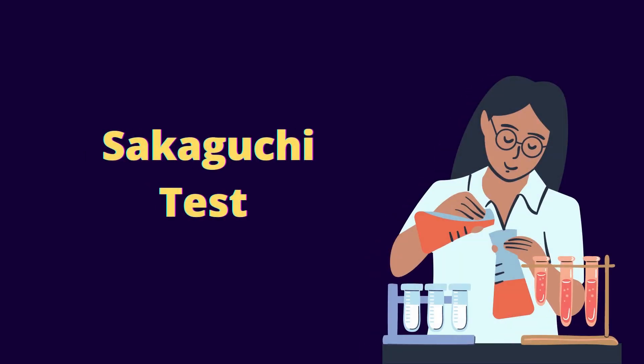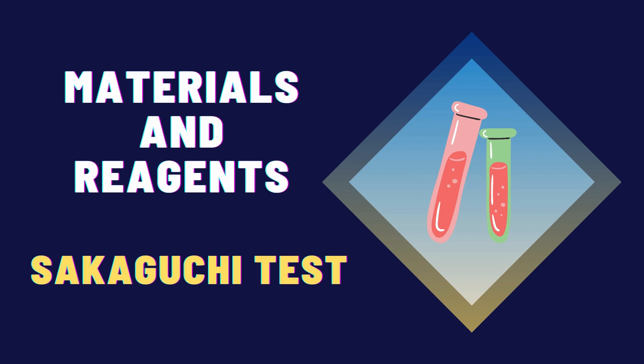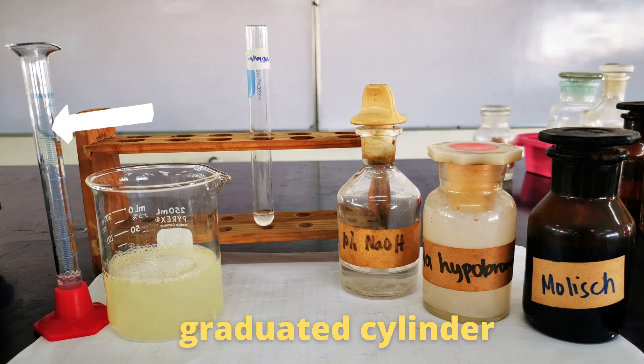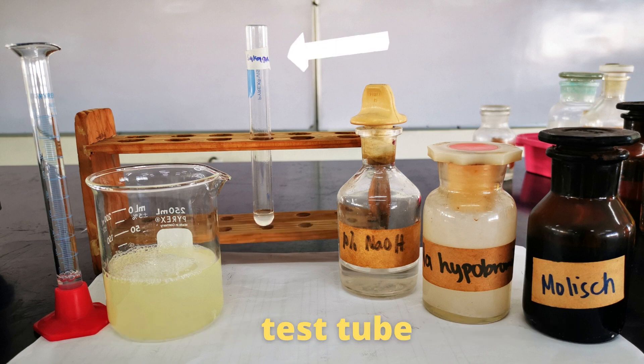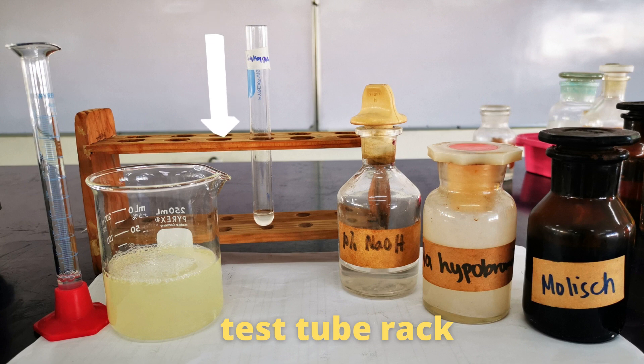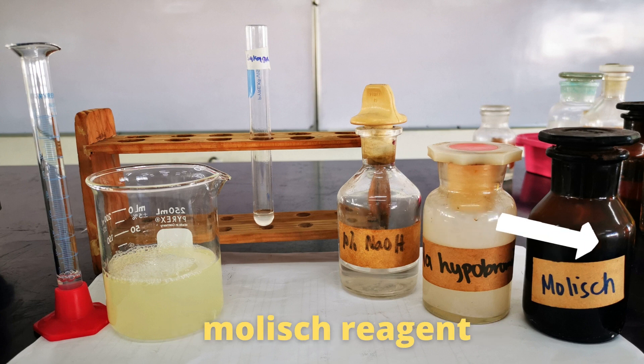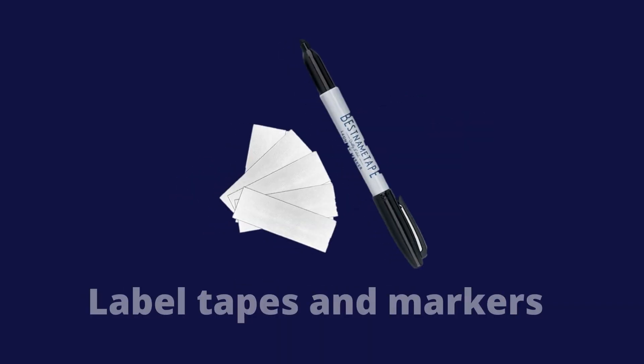And lastly, the Sakaguchi test. These are the materials and reagents for Sakaguchi test: graduated cylinder, beaker with albumin solution, test tube, test tube rack, 10% sodium hydroxide, sodium hypobromide, Molisch reagent, droppers, and label tapes and markers.